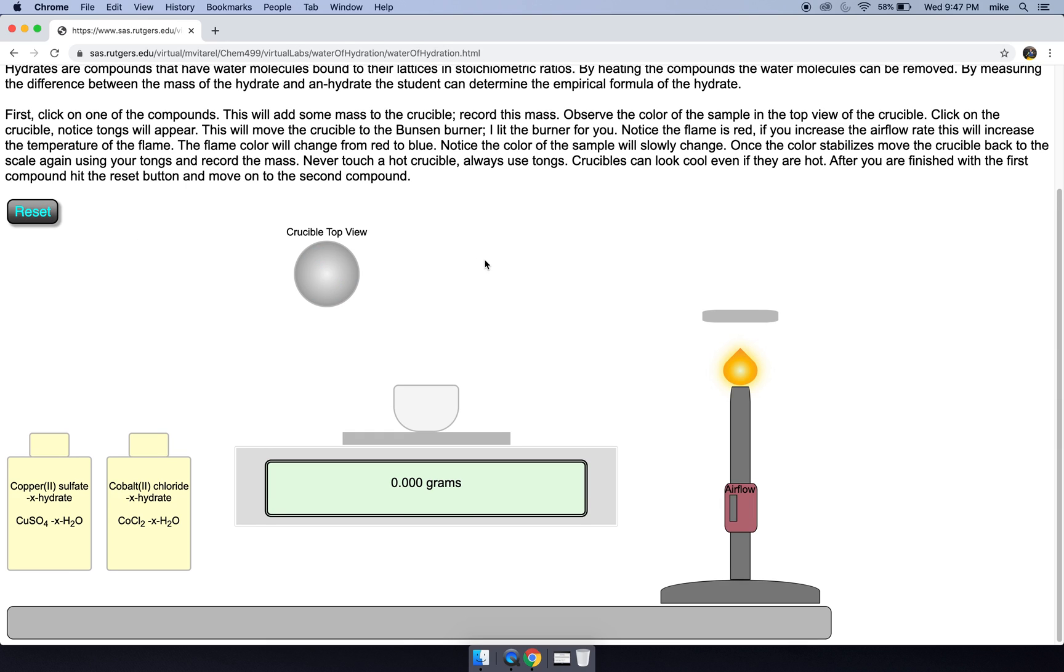One thing that's in the lab manual: what is the mass of the crucible and the lid? I originally did have masses for those here, but it was suggested to me to have it tared. So just put no measurement or N.A. for the mass of the crucible and lid in the lab manual.